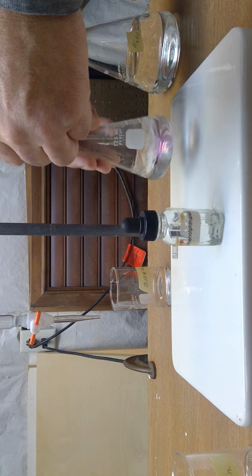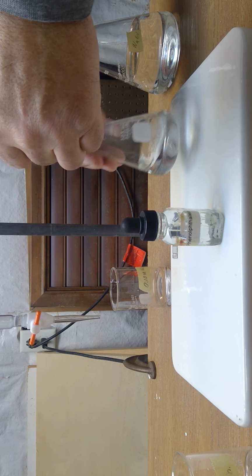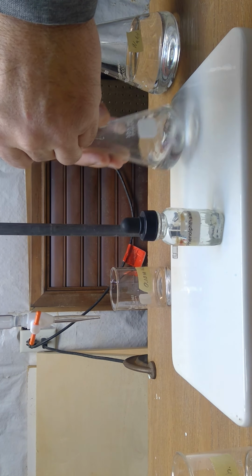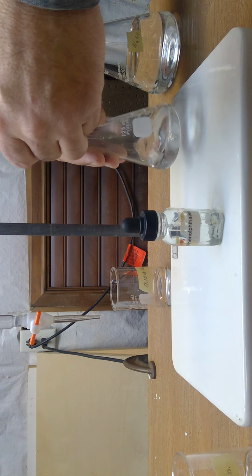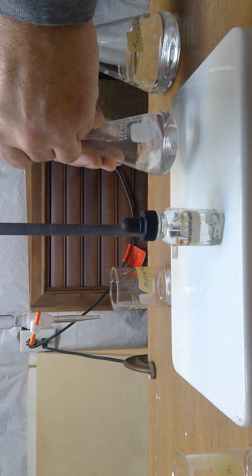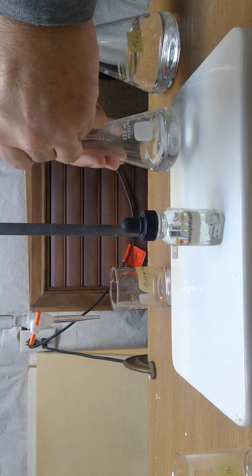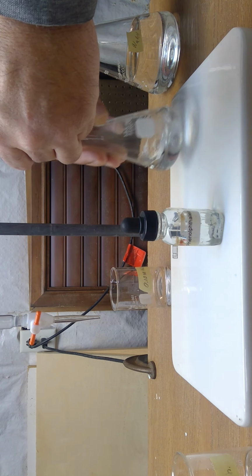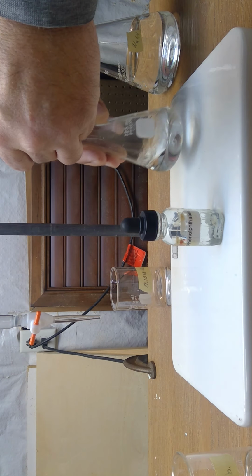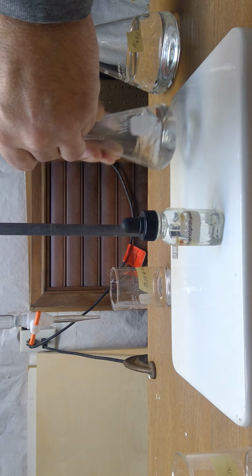And eventually you need to be down to drop by drop by drop. All right, so we're still going pretty fast, actually. And we're getting pretty close. You literally want to slow it down so you only add bits, because we're looking for that really light color pink. Now, I'll be honest, these are not the best burettes, so they don't give us a real small drop. So we'll do the best that we can.